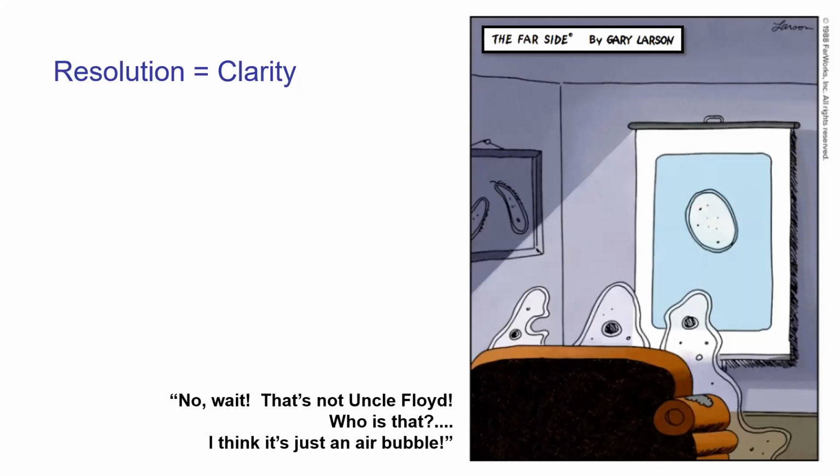So resolution is clarity. And this is where, again, going back to the cell phone analogy, newer cell phones have better lenses, which usually lead to better clarity. There's also some software things you can do too, particularly with cell phones and a lot of modern technology that help with that kind of thing, in terms of stability and whatnot. But resolution is basically clarity.